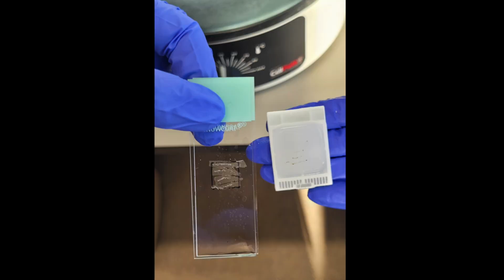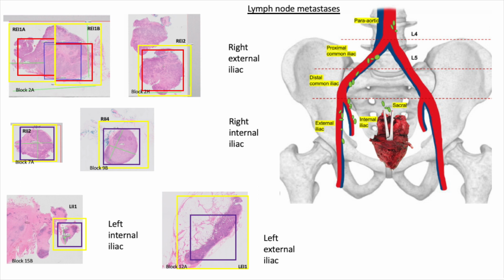This illustrates a set of biopsy cores which have been mounted, ready for subsequent processing. Here we illustrate the digital schema for various H&E stained iliac lymph nodes containing prostate mets. These sections will be prepared for sequencing as previously described.